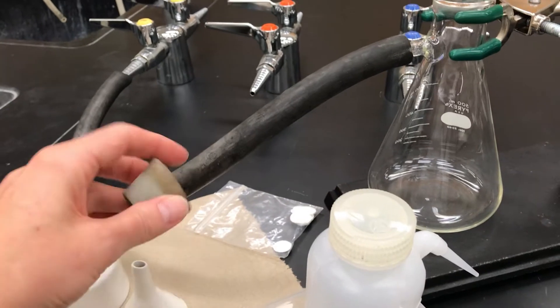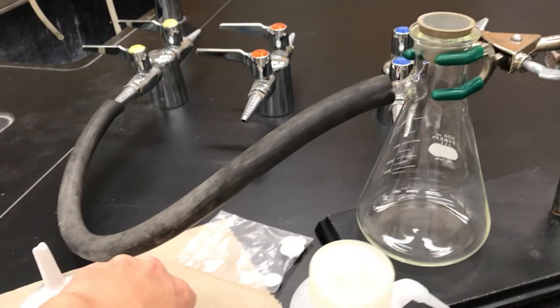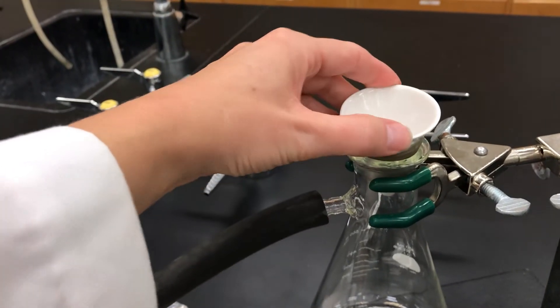We'll connect that with a little rubber adapter, and then after the rubber adapter you put in the Hirsch funnel, and those will create a nice seal.